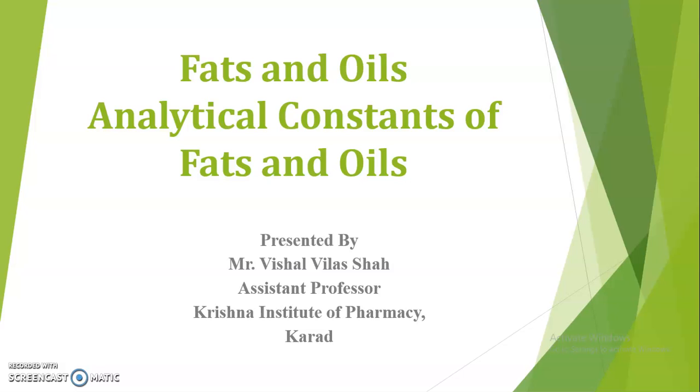In this video, we are going to discuss the second method by which we can determine the iodine value, that is the iodine monobromide method, which is similar to the iodine monochloride method also. Also, the principle involved in these two methods is the same. So in short, we have discussed the principle in the previous video.